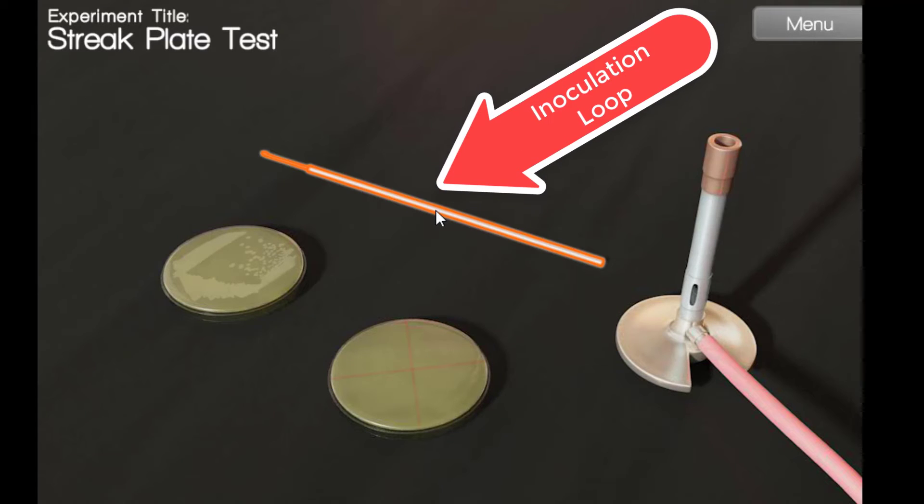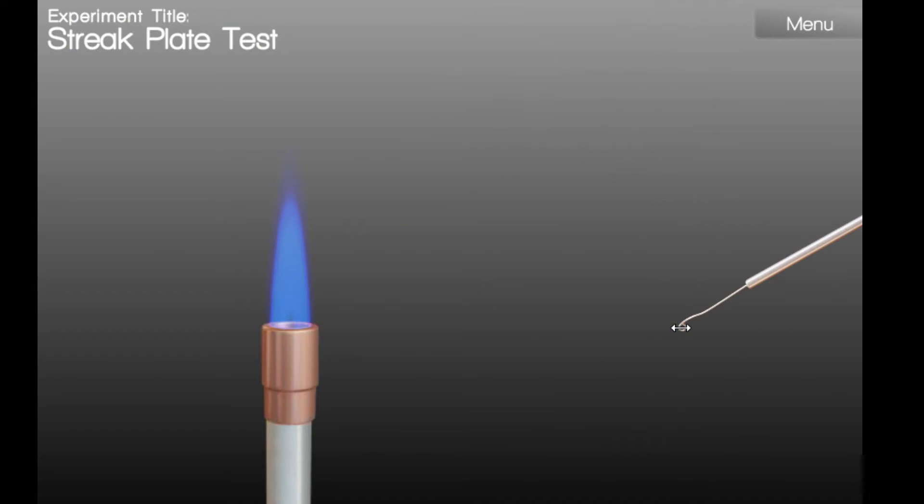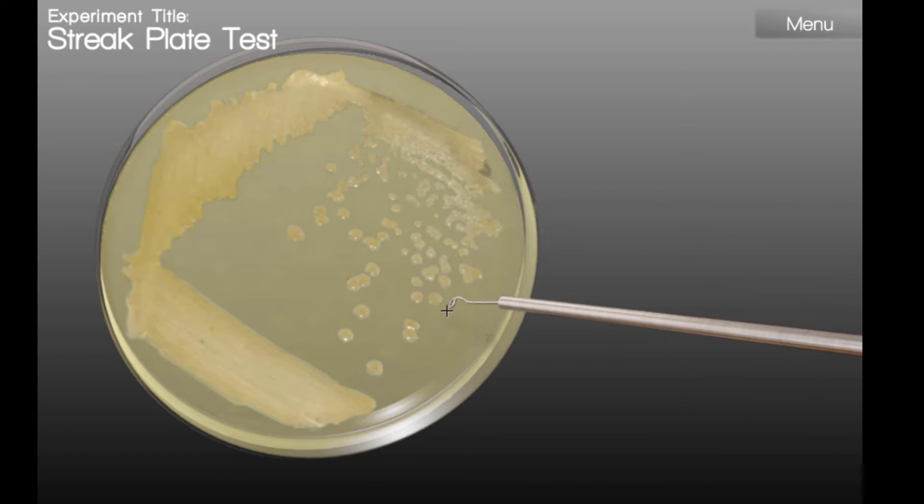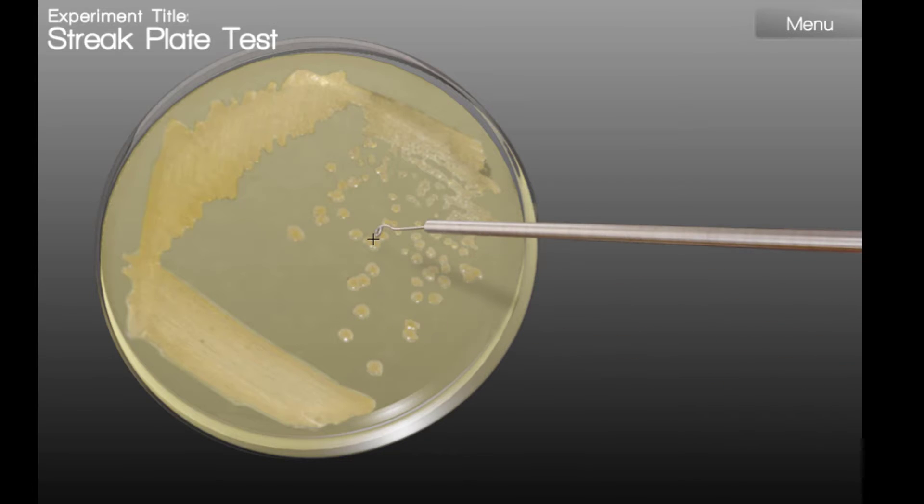This is our inoculation loop. First, we flame our loop. When you flame the loop, you want to make sure to pass it over the flame until the loop is glowing red. Now we can choose our colonies. We'll want to make sure to choose an isolated colony, one that looks nicely round, that's off by itself.